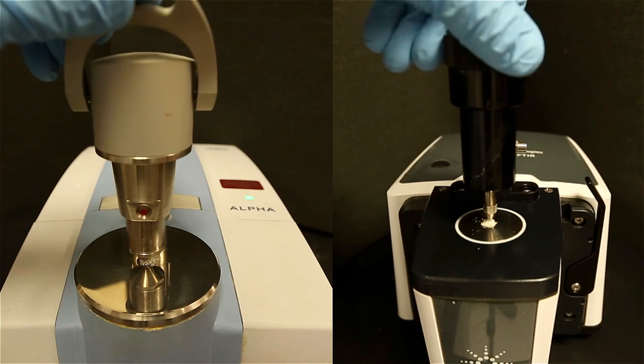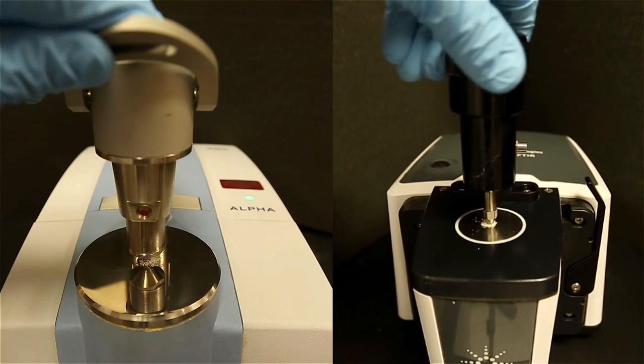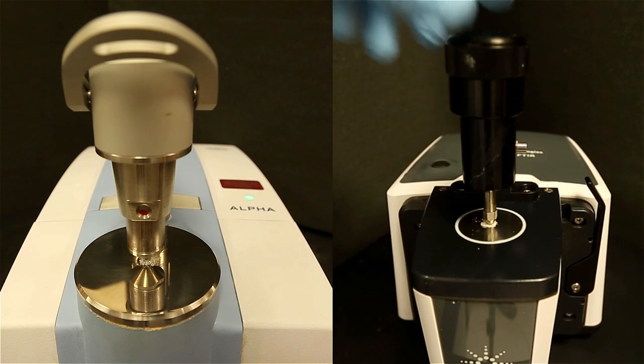For the Agilent instrument, a knob will have to be turned to allow the pressure tower to come down over the sample. Stop turning the knob when you feel resistance.